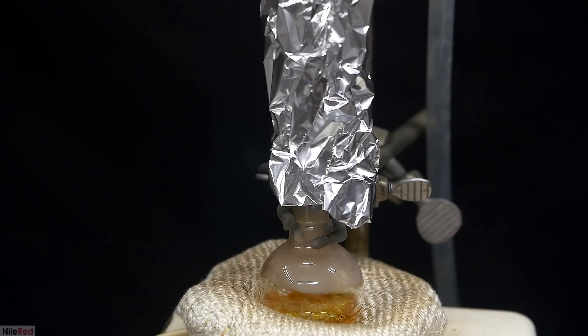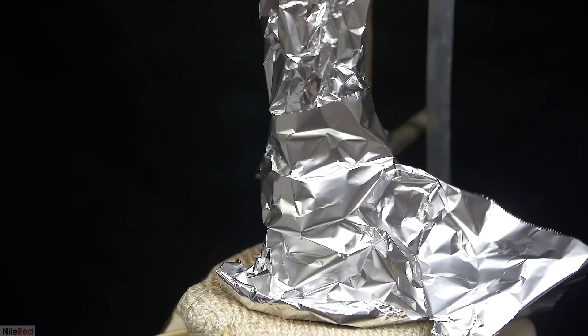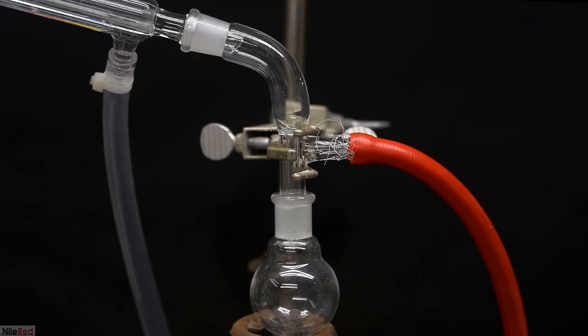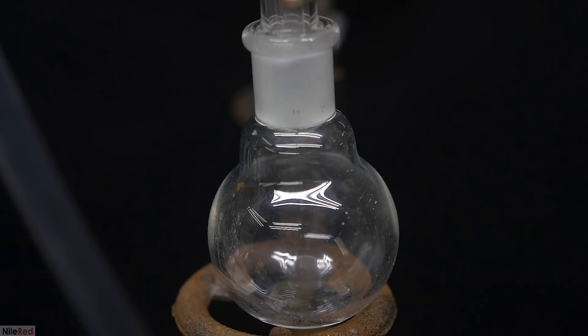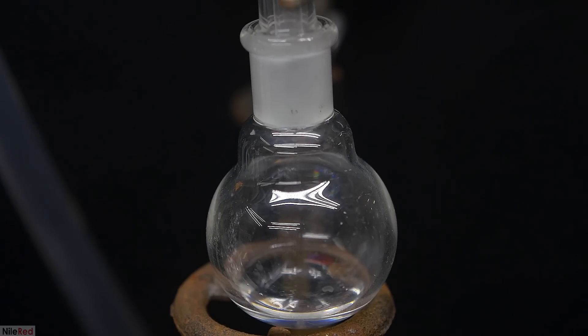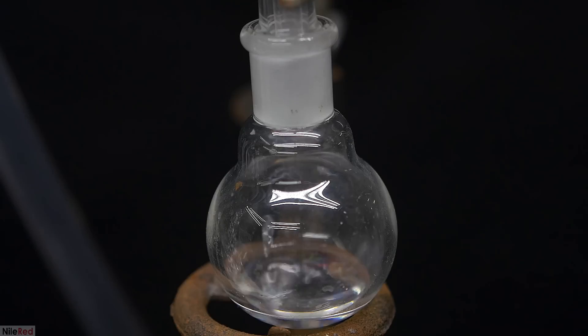When distilling things like benzaldehyde, it's extremely important to use vacuum because we have to get rid of any oxygen present in the apparatus. If there's any oxygen present, it will react with the benzaldehyde to form benzoic acid, which is pretty undesirable. The boiling point of benzaldehyde is lower than cinnamaldehyde, so the first fraction that comes over will be the benzaldehyde. We keep collecting the benzaldehyde until eventually it stops coming over and the temperature on the thermometer starts to increase.